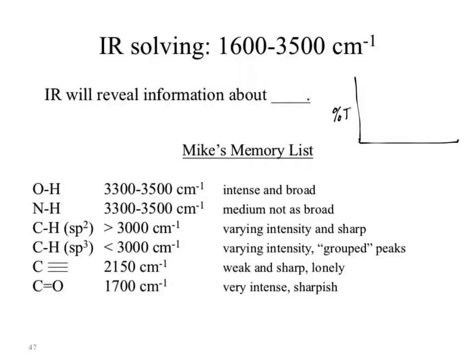When we look at this as percent transmittance, our signal usually runs up here, right? What is that signal as shown? Is that intense? No. But that's 100. Isn't 100 intense? If you got 100 in this class, you're telling me you're not going to be intense? Yes. You're probably going to be really intense.